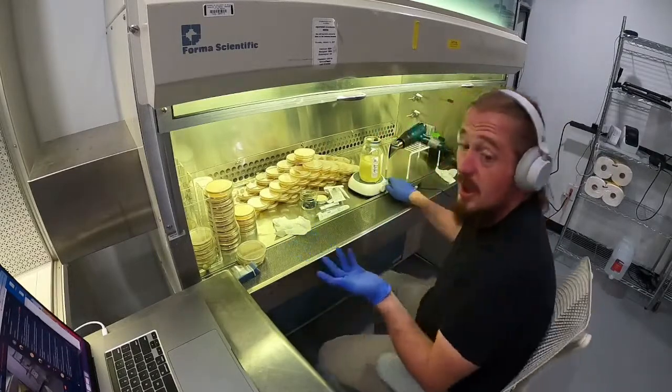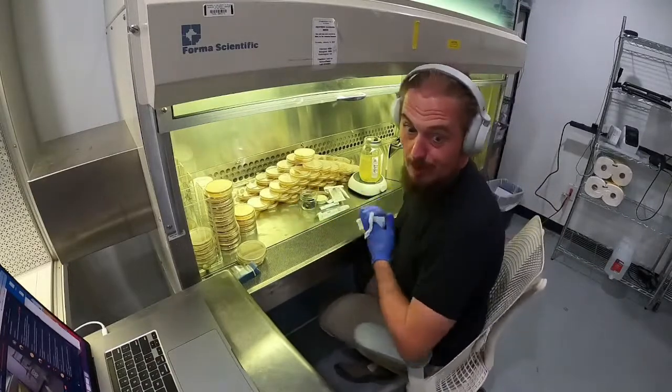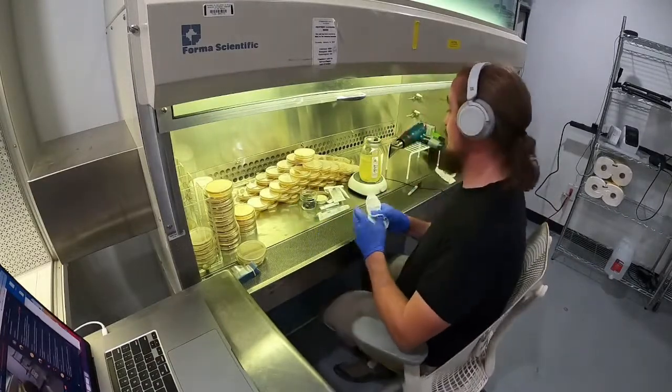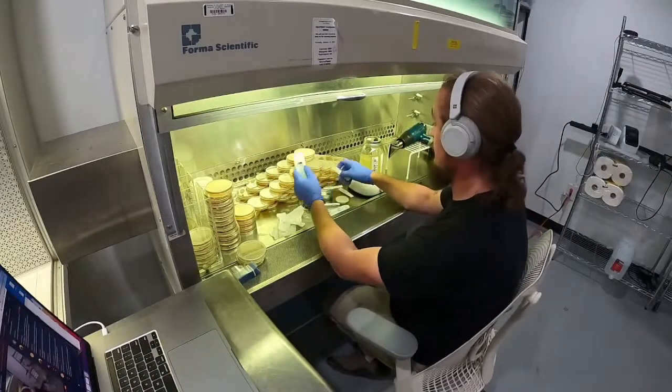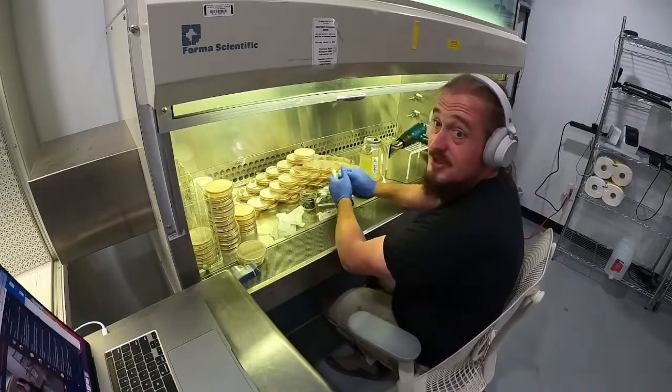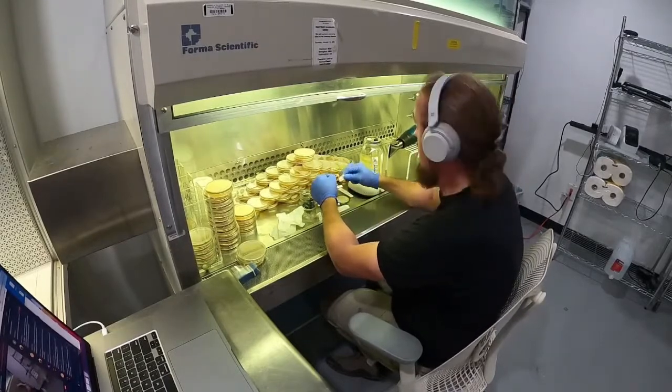Because in that way, I don't have to pay crazy markups for things with pre-built filter patches in them. Also, Micropose makes some good stuff. Some of his filter patches are so sticky that it'll pull the glove off your hand.